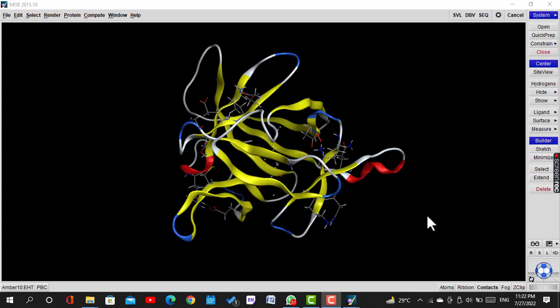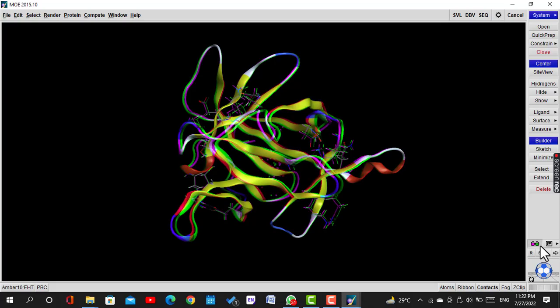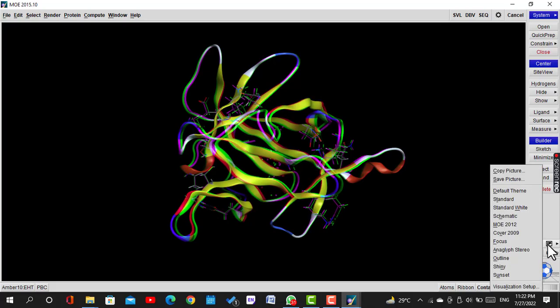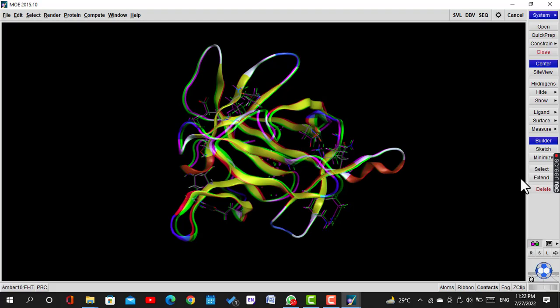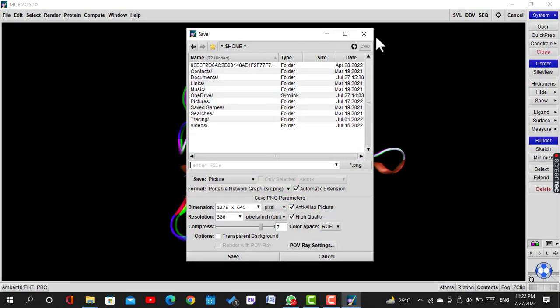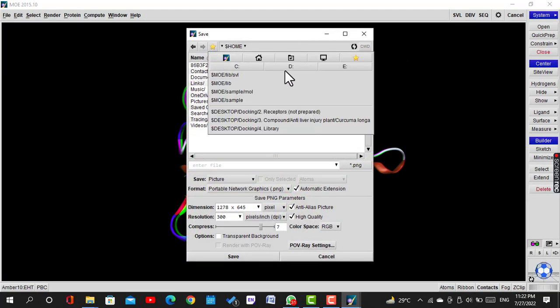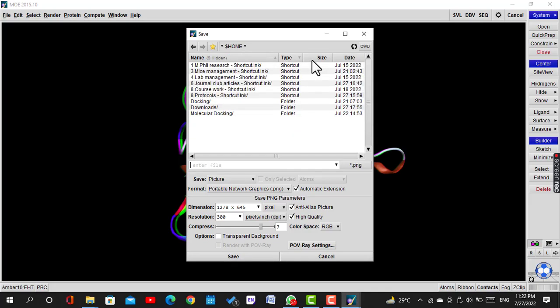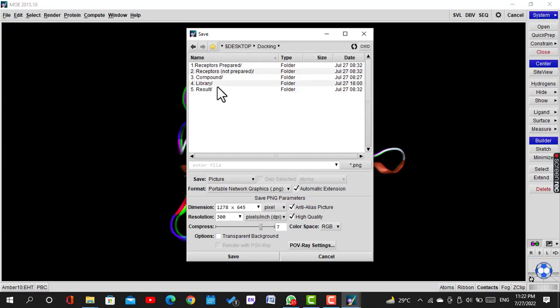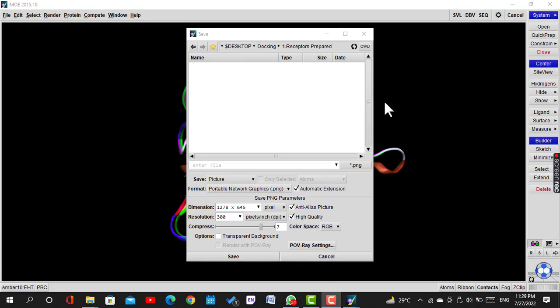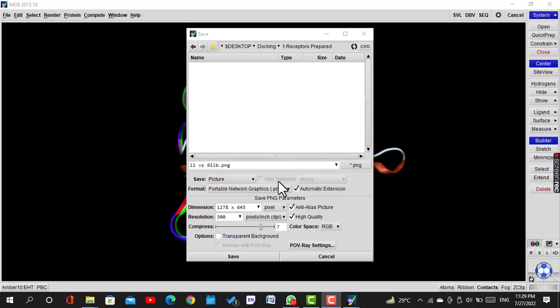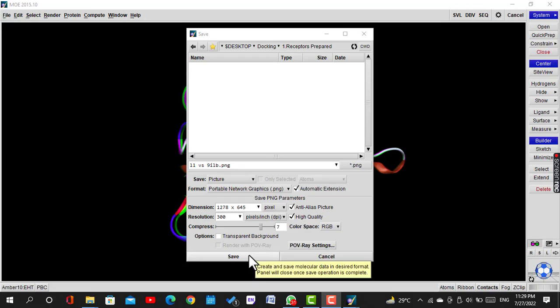Now this one is our prepared receptor. We click on the disk icon on the right bottom corner and save the prepared receptor. Here we enter the file name Library 1 versus 9ILB, that is our receptor, and we saved it in prepared receptor.